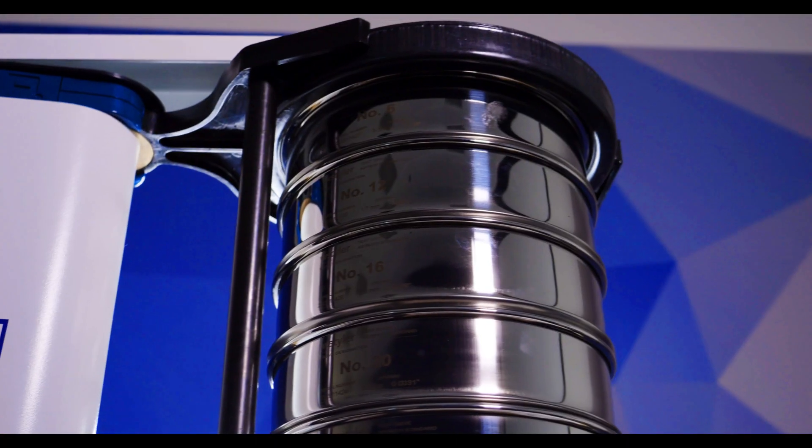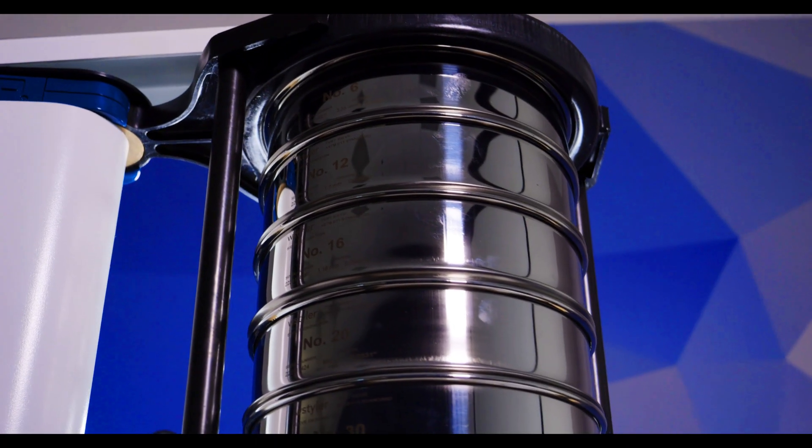But I should note, there are dozens of mechanical sieve shakers on the market. The performance will vary from manufacturer to manufacturer.